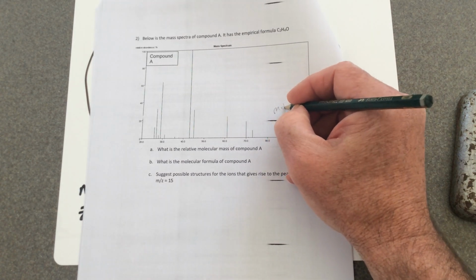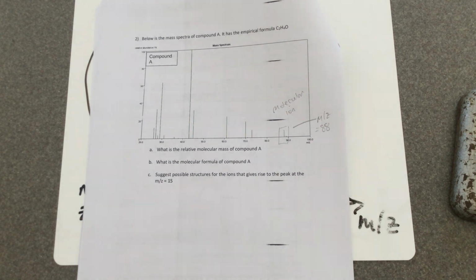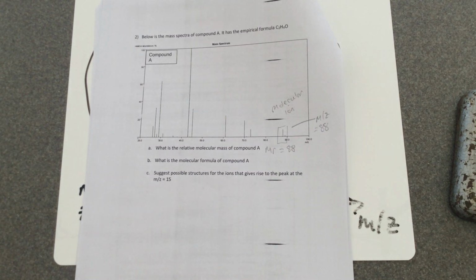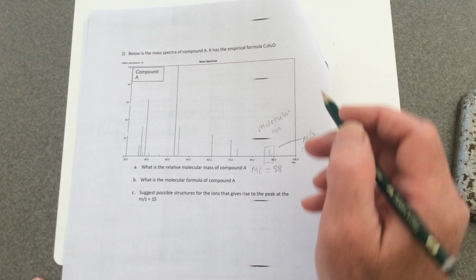This is caused by the molecular ion. It's called the molecular ion peak. And the molecular ion peak tells us that the MR of the molecule, in this case, is 88, because that's where the MZ value lies. So now I know the MR of the molecule. I've been given the empirical formula of the molecule.